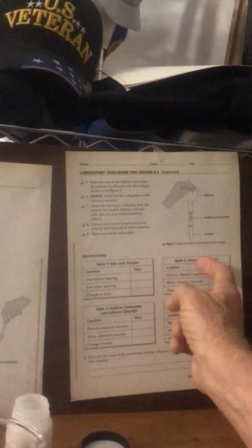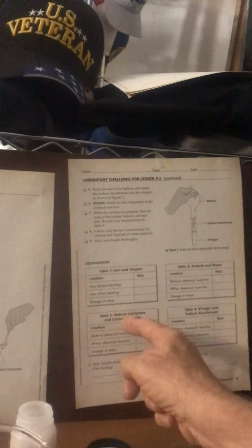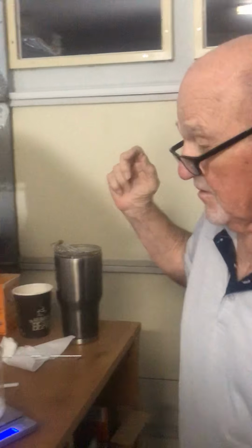We've done 3 so far. We've done the iron and oxygen, antacid tablet and water, and this is the sodium carbonate and calcium chloride. Next, we're going to do vinegar and sodium bicarbonate, which is baking soda. Okay, that's going to be next.